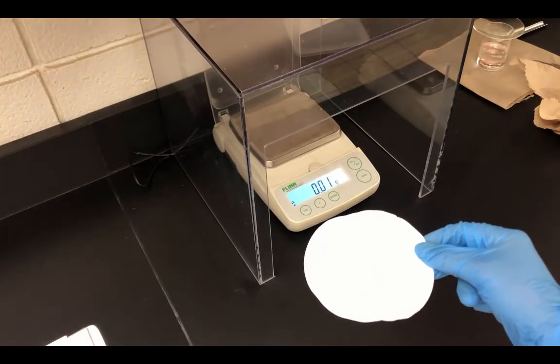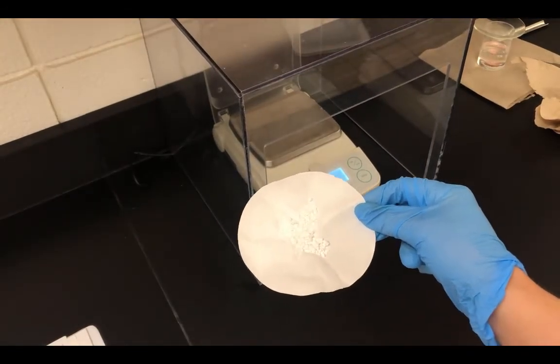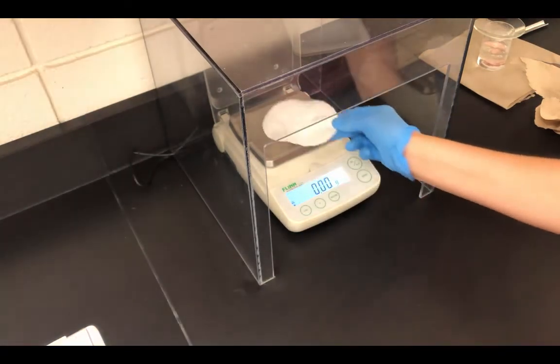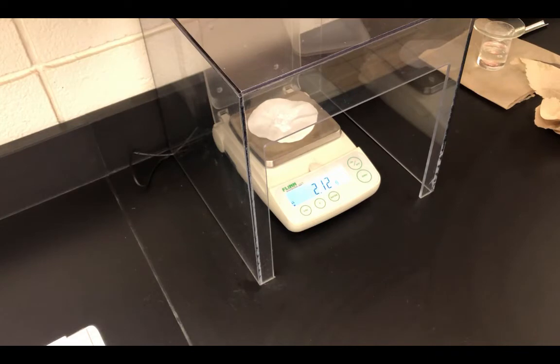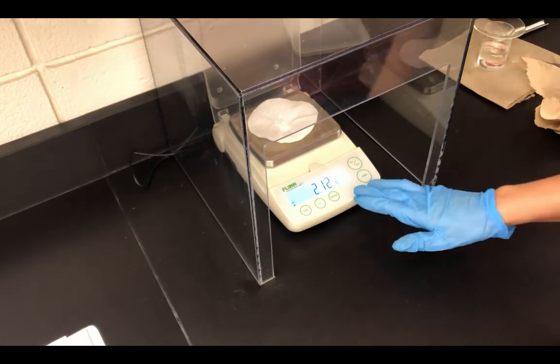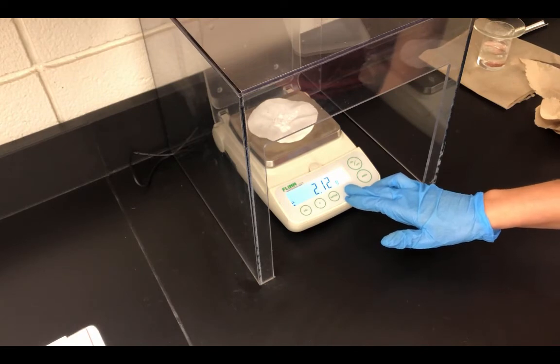So after being in the drying oven for another 5 minutes, here is the solid calcium carbonate. I'm going to go ahead and find the mass again. So the point of putting it back in the drying oven was to try to remove any more moisture, any excess of the solution, the filtrate that may have still been part of the precipitate. And so after going in for another 5 minutes, notice that the mass has slightly decreased to 2.12 grams.